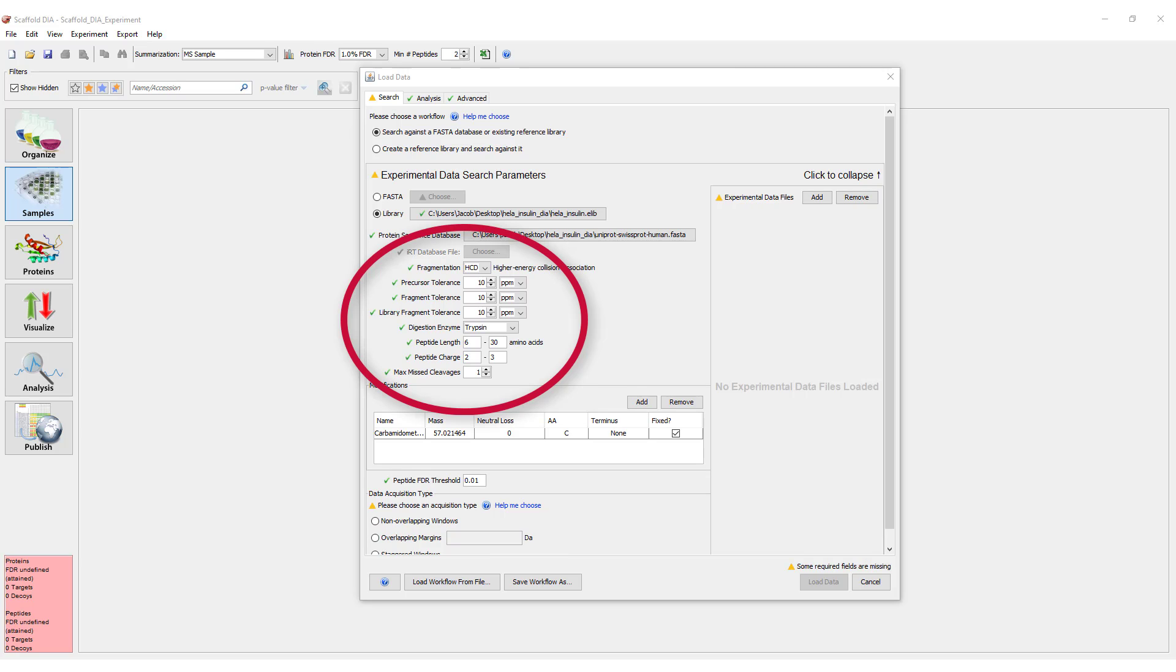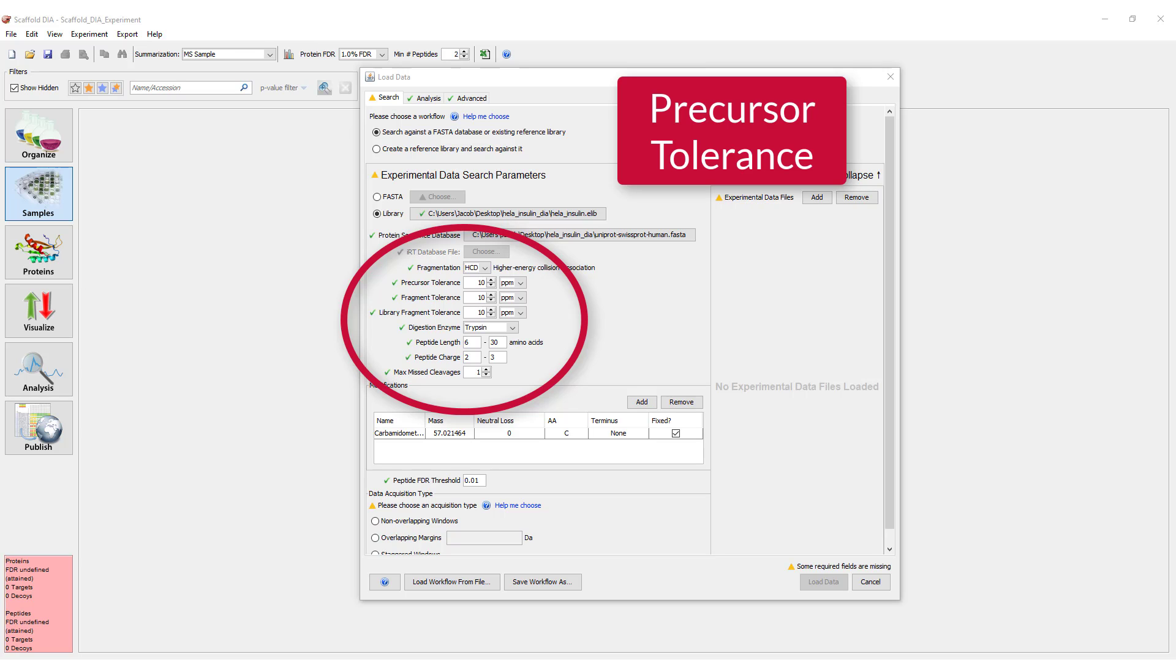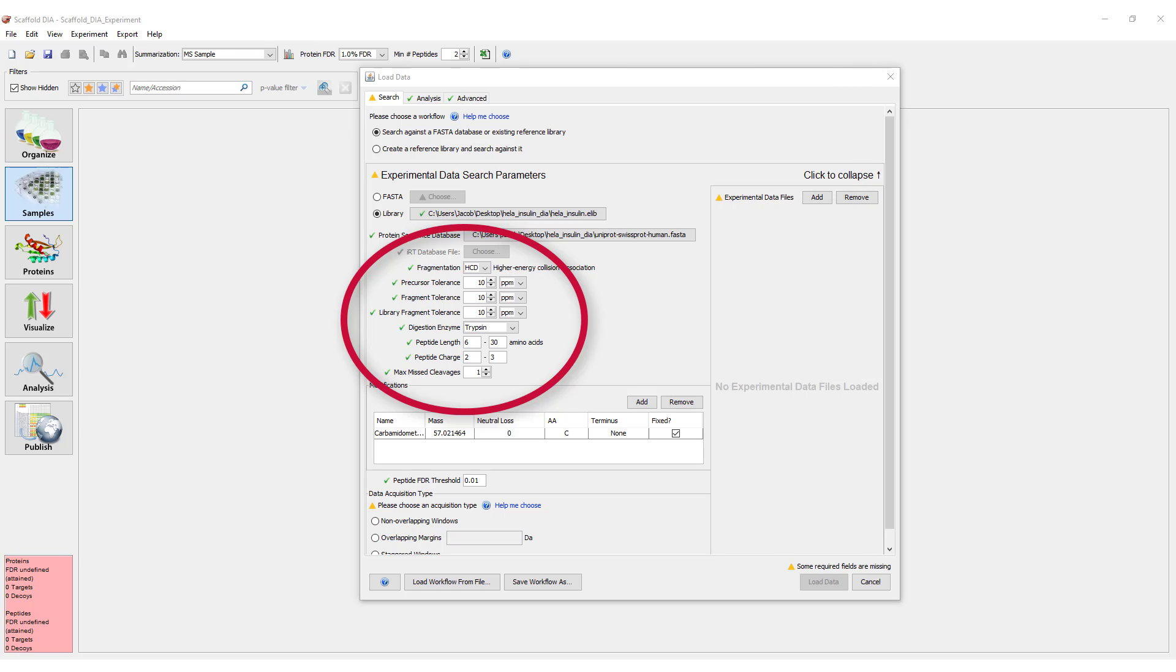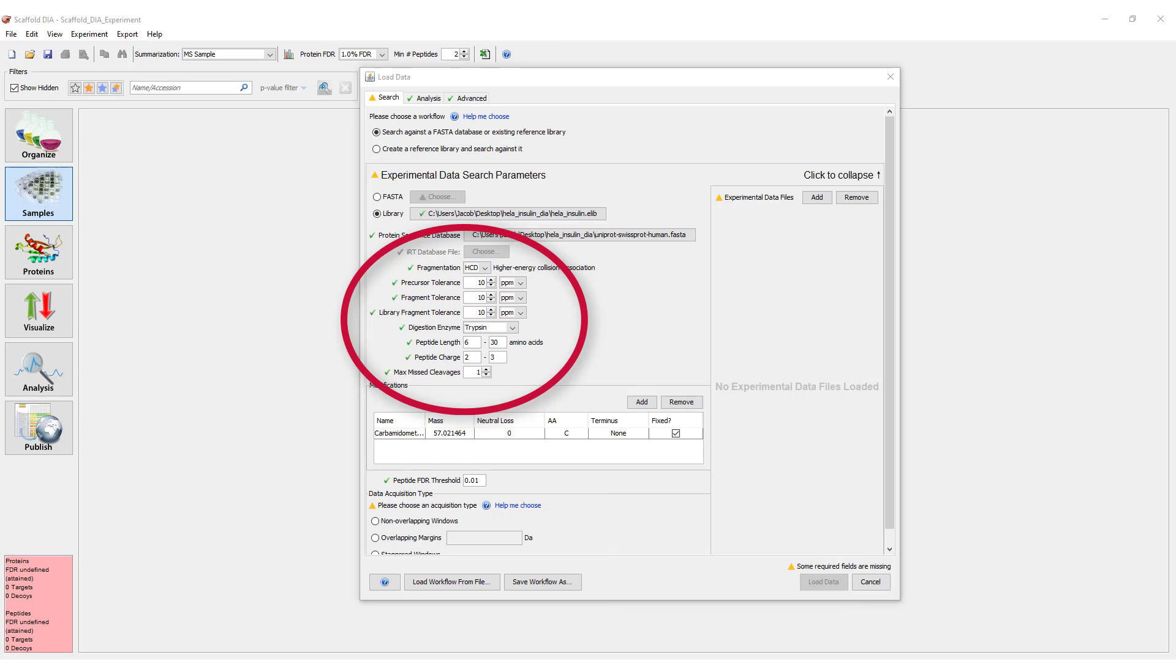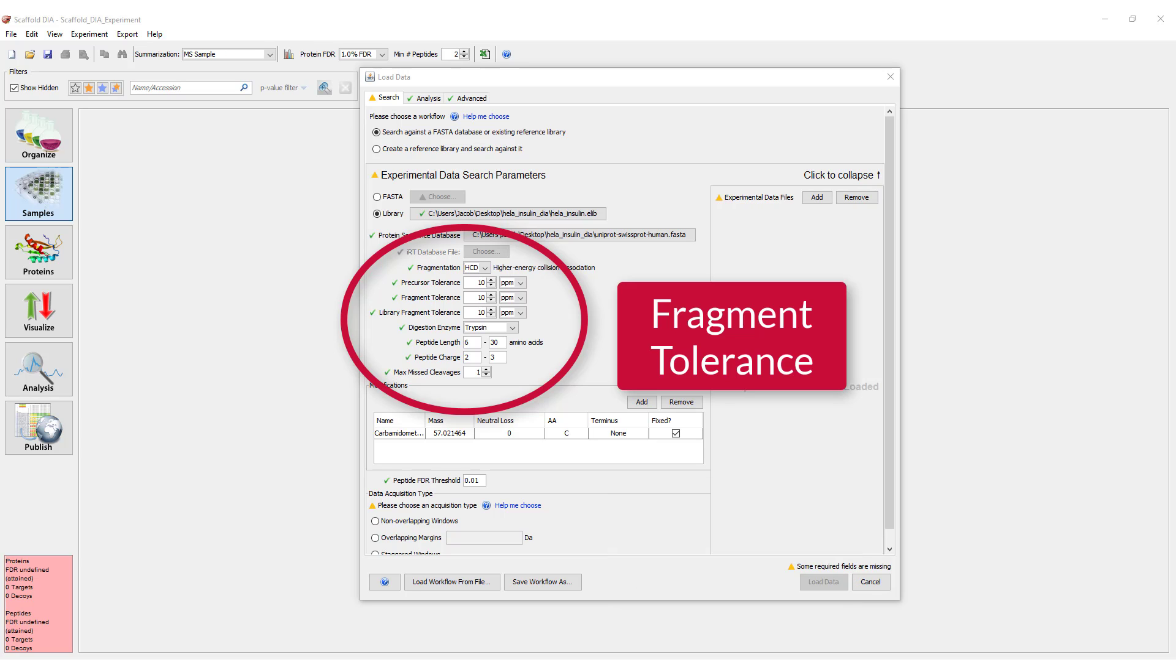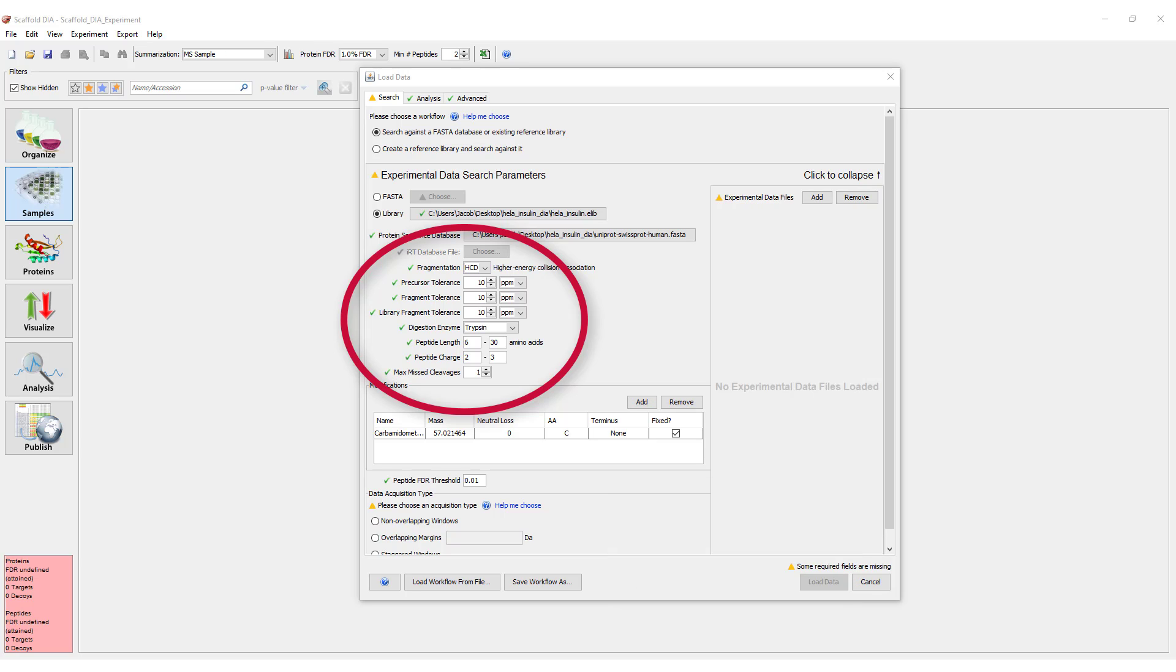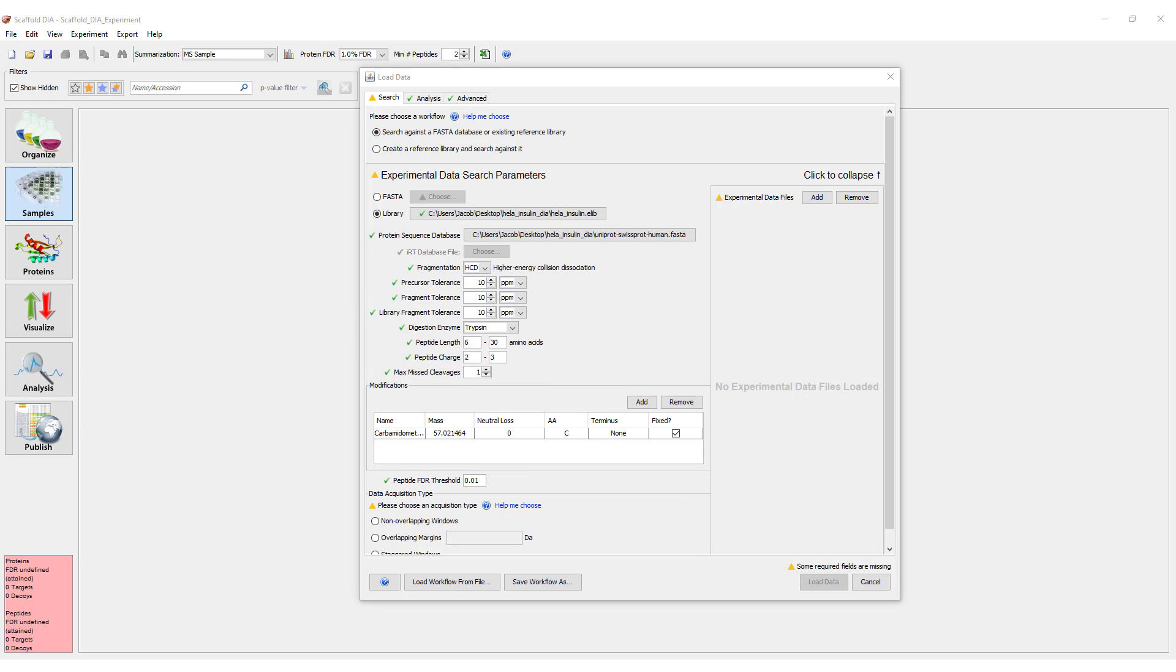The next group of parameters should be adjusted based on the data collected and include precursor and fragment tolerance, digested enzyme, and missed cleavages. Set these values appropriately for the data you generated. If you are in doubt, the defaults are a good place to start.